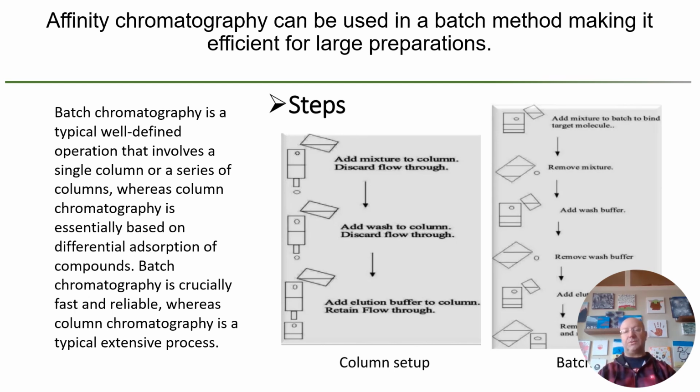Then if you choose to do so, you can load that directly onto a column with the analyte bound to the ligand and do a final wash on the column and an elution. It's an industrial technique that's used quite often for purification of very large amounts of protein.